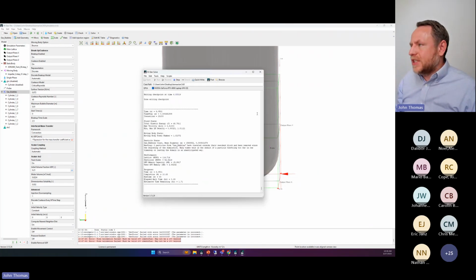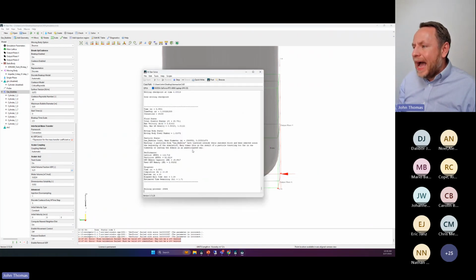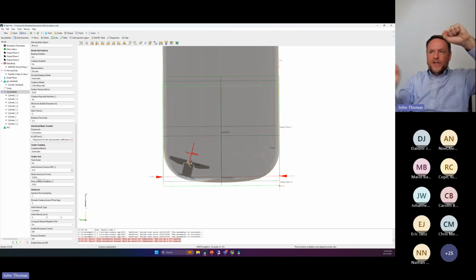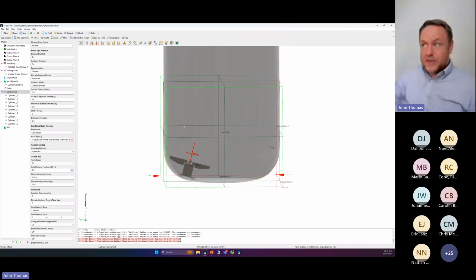This is all calculated on a bubble by bubble basis. So when I go and run this, let me stop this good one here. I now have oxygen coming in through the bubbles. We could have any number of gases in these bubbles, transferring to the aqueous phase or not. But in this case, air coming in with oxygen in it, oxygen moving from the air to the surrounding aqueous phase, that oxygen being mixed in the aqueous phase, the bubble mixed as well and moved as well, the bubble eventually breaching the surface. And because of that action, I'll have oxygen accumulation throughout this vessel until it achieves some saturation limit. Let's watch it.